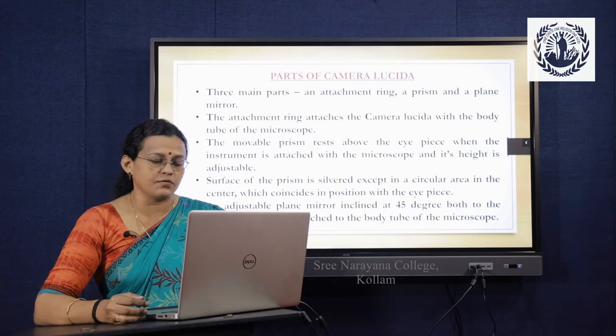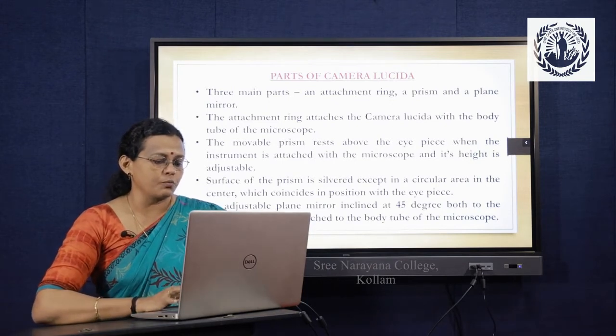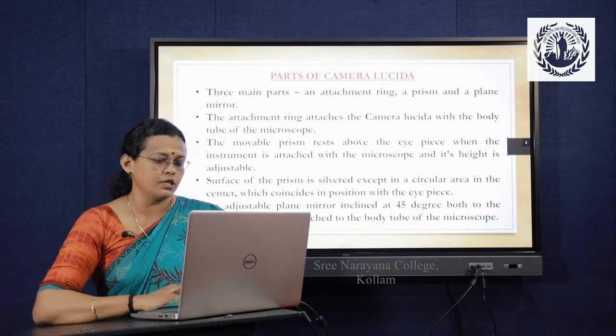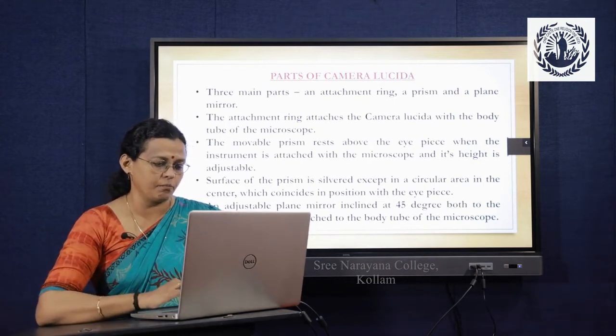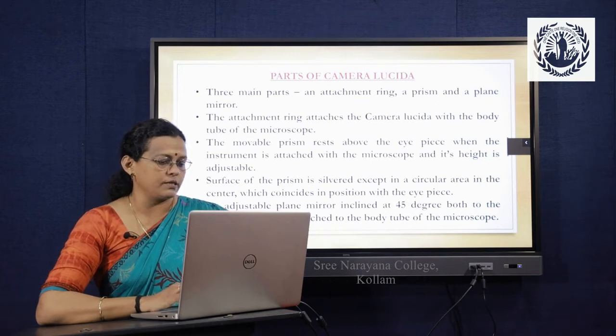Now we shall see the different parts of camera lucida. It has an attachment ring. This attachment ring is used to attach the camera lucida to the body tube of the microscope. Then it has a prism which works on optical principles and a plane mirror. So that is already explained.